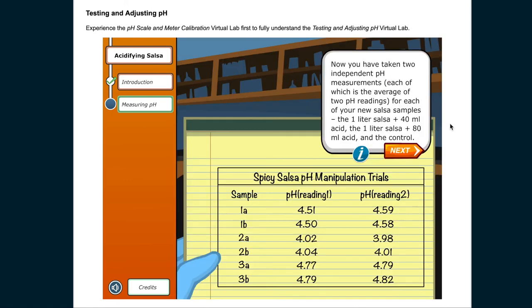Now you have taken two independent pH measurements, each of which is the average of 2 pH readings for each of your new salsa samples: the 1 liter salsa plus 40 milliliters acid, the 1 liter salsa plus 80 milliliters acid, and the control.